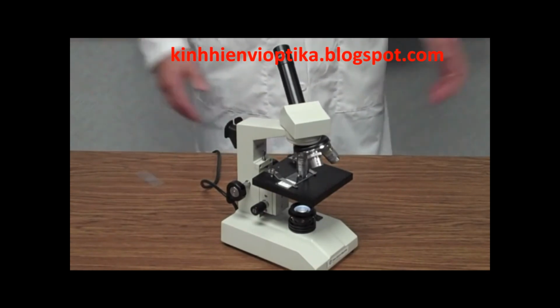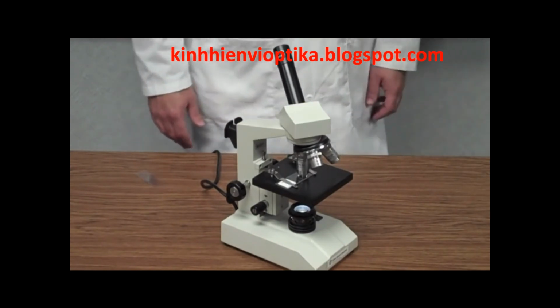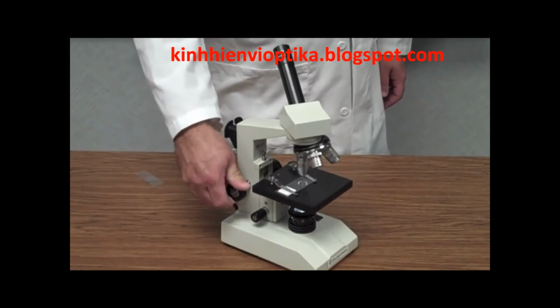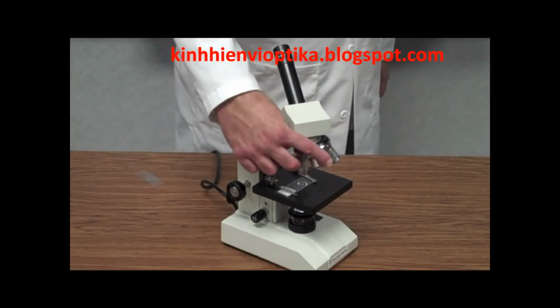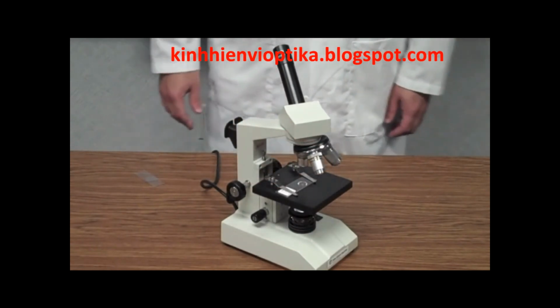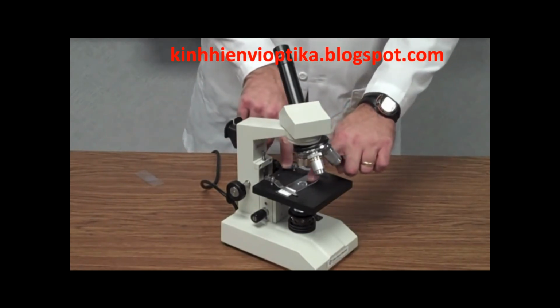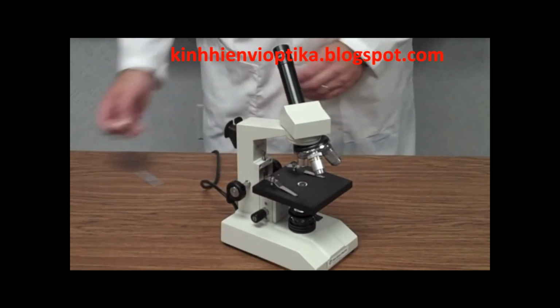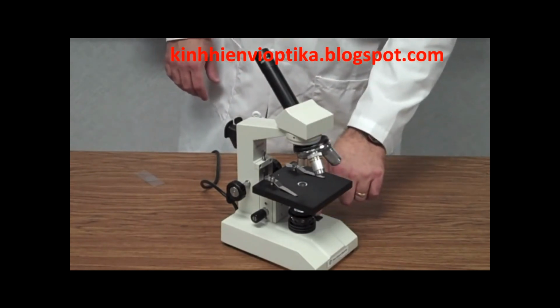Now, I'm done with this particular slide, so I'm ready to pack up. Very simple process. Take the stage and move it all the way downward as far as it goes. Once you move the stage downward, you take the low power objective and you lock it in place. We always store the microscope on low power with the stage all the way down. I can remove my prepared glass slide and go put it away. Don't want to drop that, it'll break. And then obviously turn your light source off.